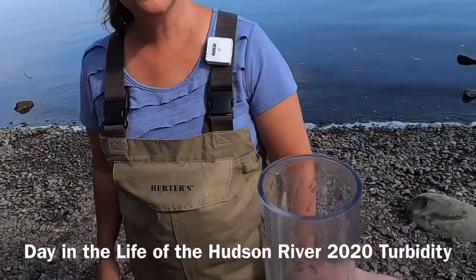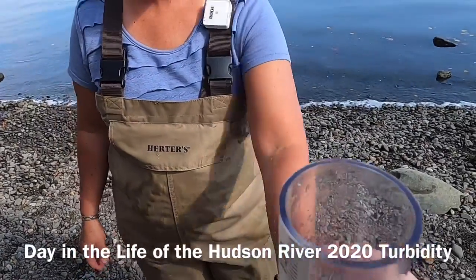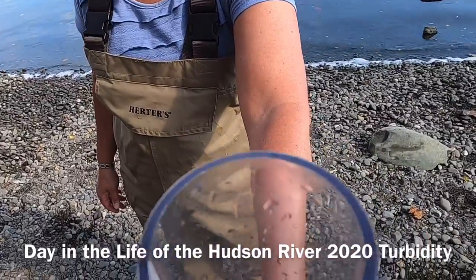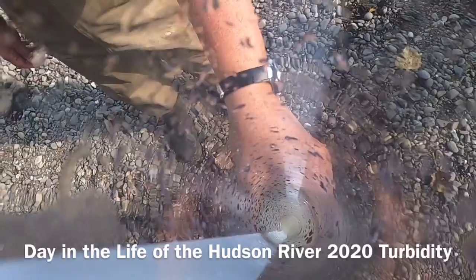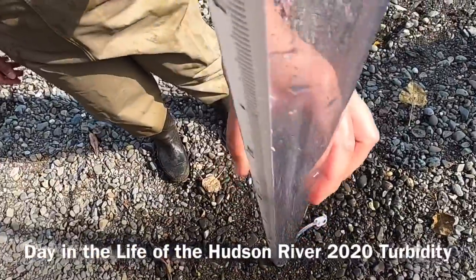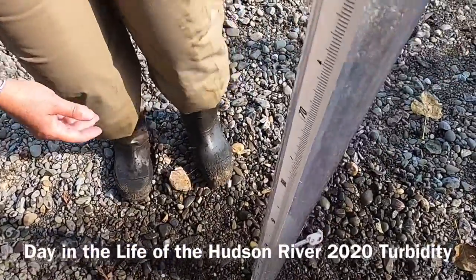So we're going to take a look down our tube. I'm not sure if you're going to get to see that distinction through the camera. Okay, and we're going to go ahead and take our measurements.